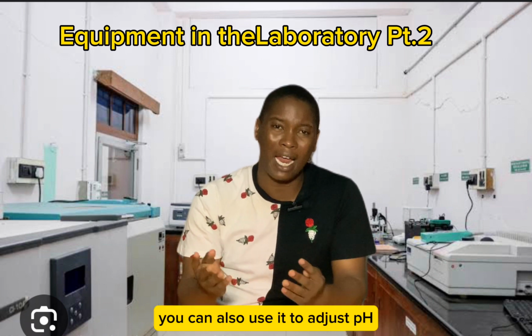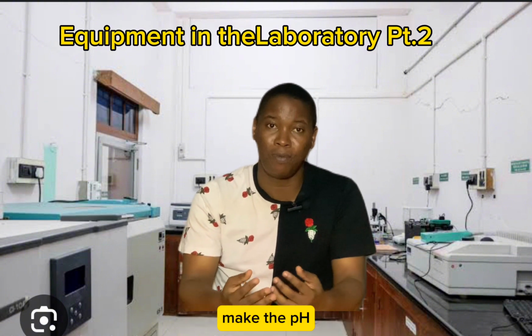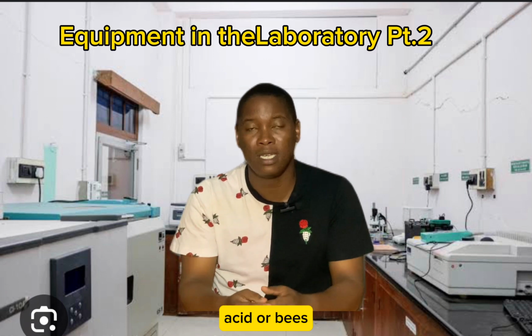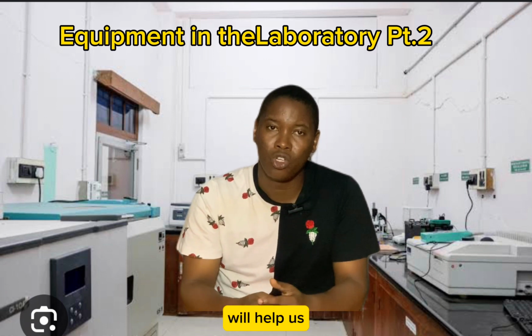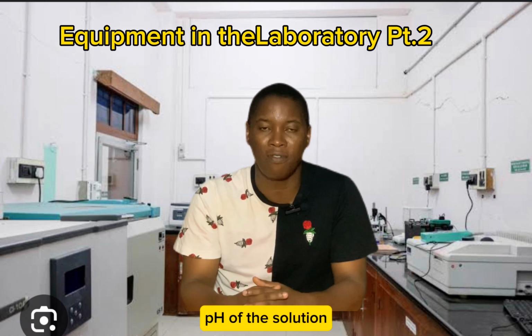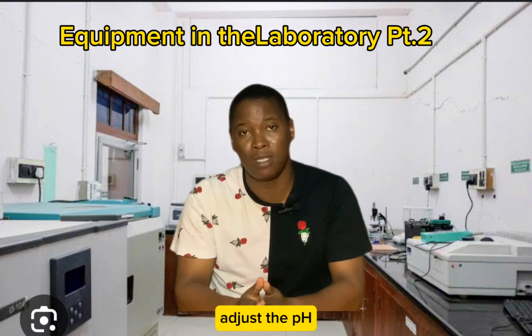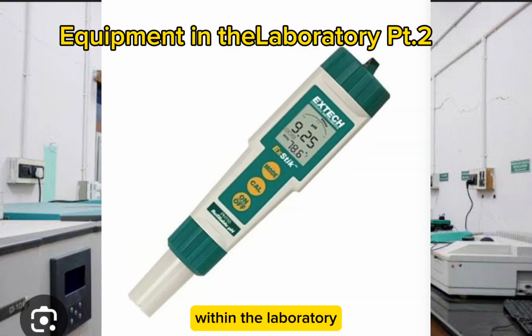You can also use it to adjust pH. So if you want to adjust pH in a sample, make the pH either lower or make it higher by adding either acid or base, this can be done using the pH meter. The pH meter will help us to know the actual pH of the solution that we are working with. So either to check pH or adjust the pH, we make use of pH meters within the laboratory. This is important to know.